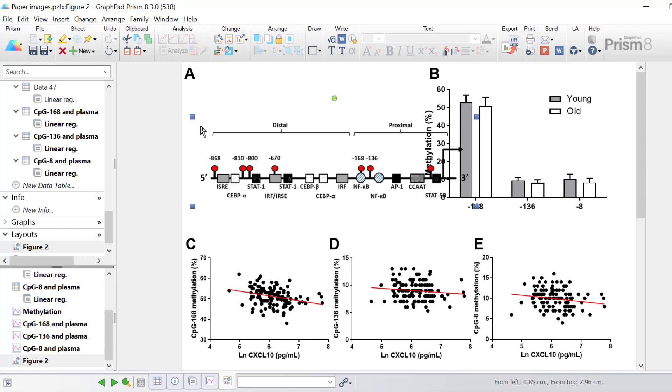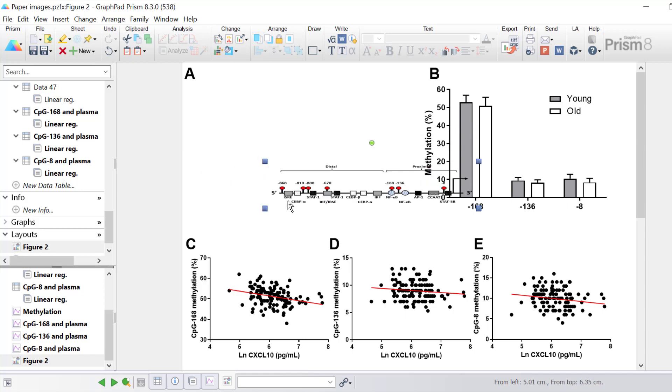However if you hold the shift button down whilst clicking and dragging on one of the blue squares you can change the height and the width independently. Notice that the ratios will then change so you could easily distort the image.